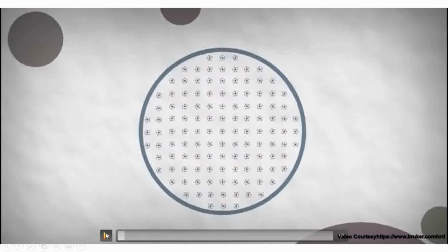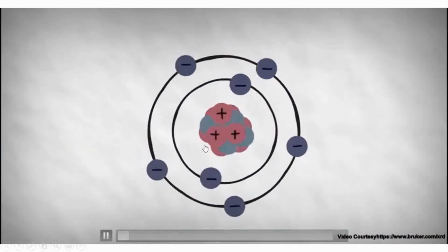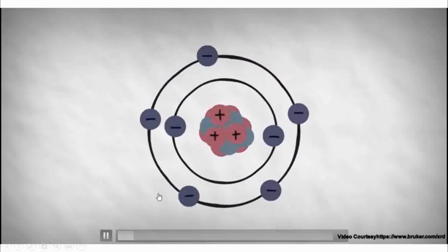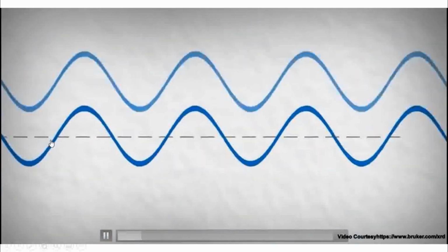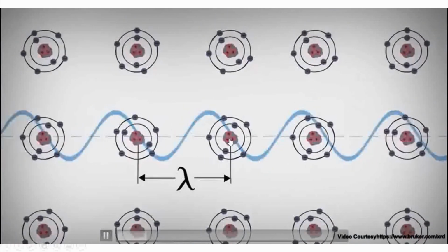So you can see here, this is basically all the atoms and they are in a crystal formation, right? So in crystal formation, you see the pattern, the patterns are all fixed, which I was trying to explain to you. And each of these, you can see here the nucleus and the electron environment. So electrons revolving around them. And these electronic clouds, when you have the X-ray, this is basically the lambda, the one wavelength.